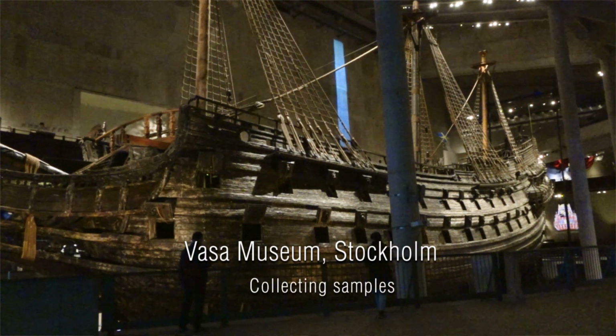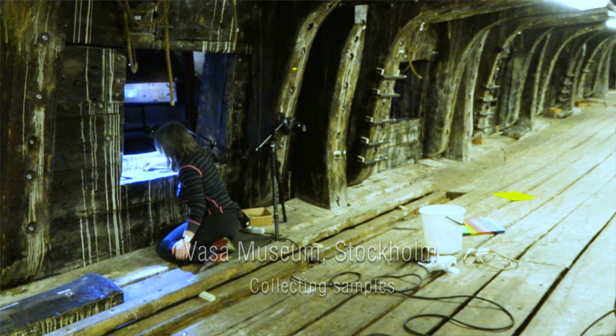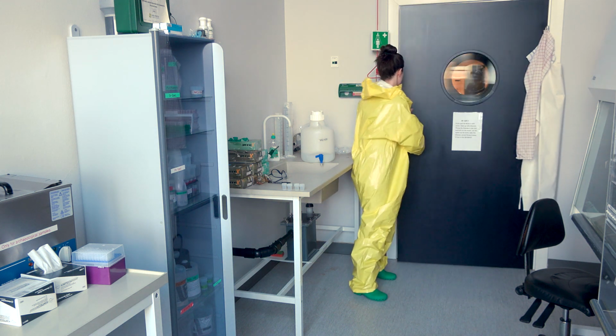In the timber project, we are using tree ring analysis. That's where I'm coming from, to examine where the timber in the past comes from, so that we can map the changes in timber trade and the changes in exploitation of timber in Northern Europe over time. But there are gaps in this knowledge, so we're experimenting with other techniques to identify timber's provenance, where the timber originally grew. Among other things, we're using stable isotope analysis, particularly strontium, to try and identify the timber's provenance. And Alexandra Rodler is carrying out those experiments.